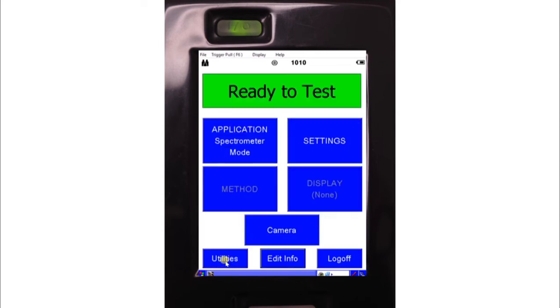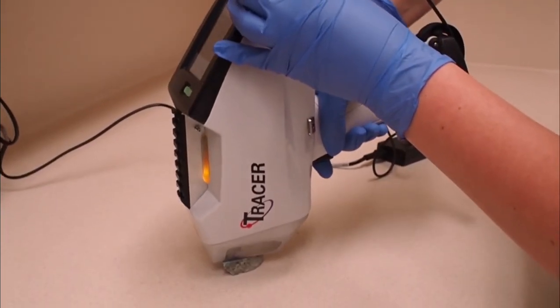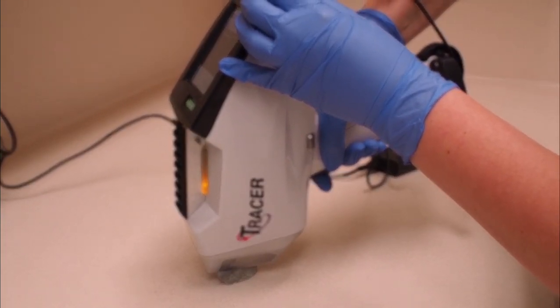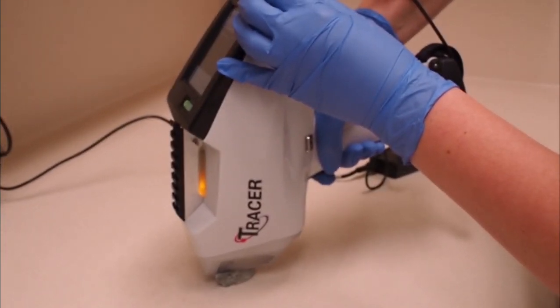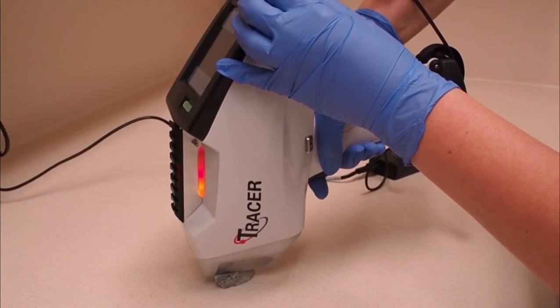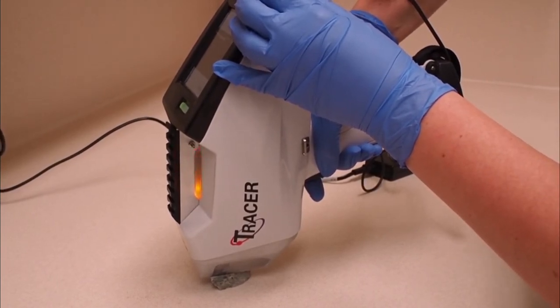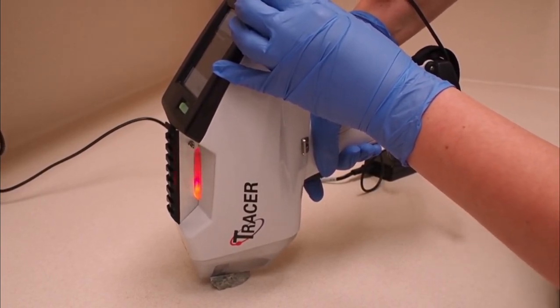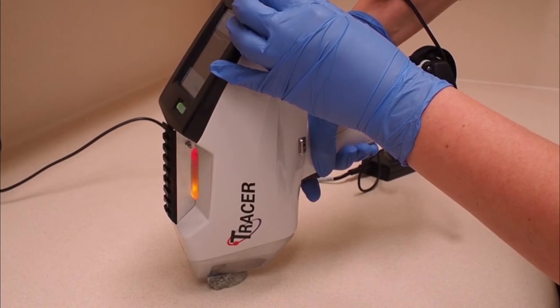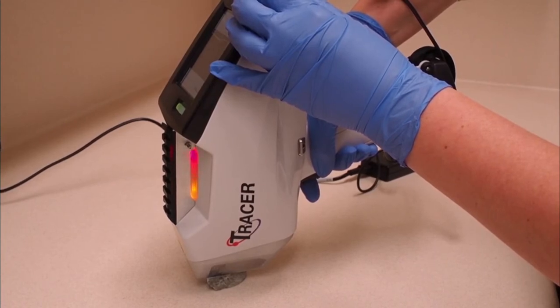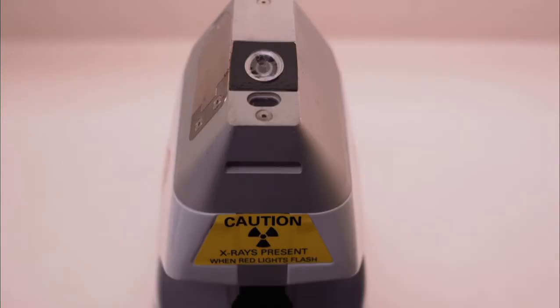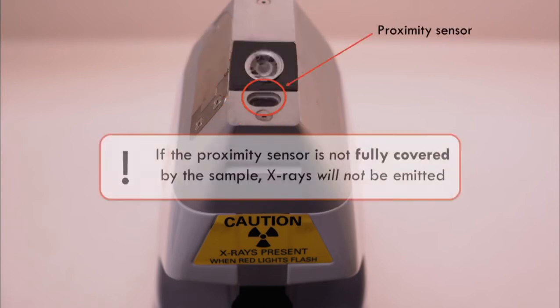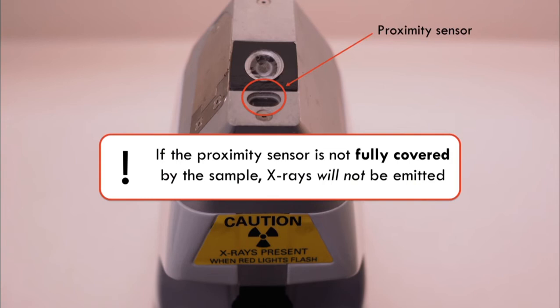Once the conditions are set, position the instrument window against the sample and pull the trigger. The ridge lights will flash red while X-rays are being emitted from the instrument. It is important to note that Tracer 5i has a proximity sensor above the measurement window. If this is not covered by a sample, then no X-rays will be emitted as a safety precaution.